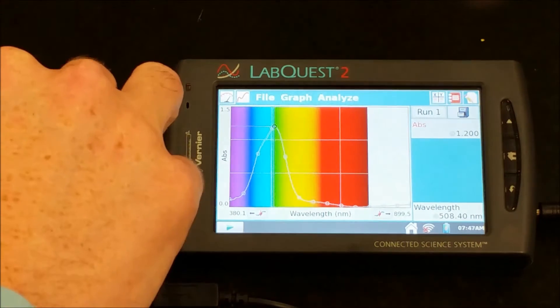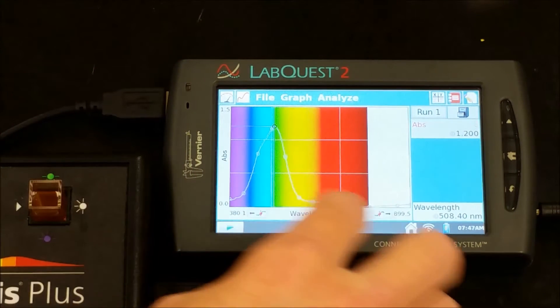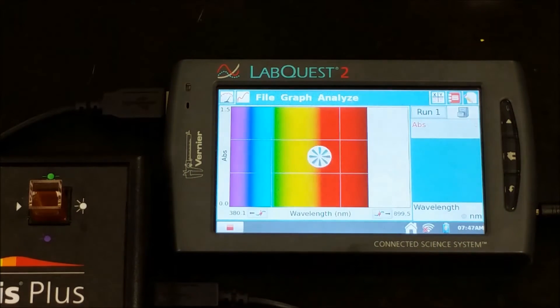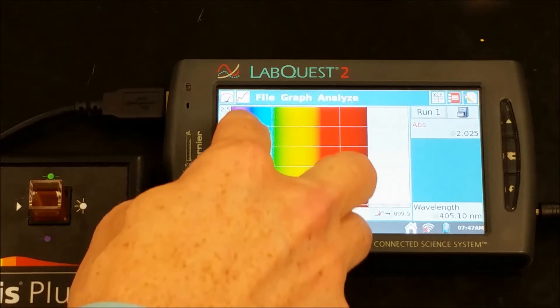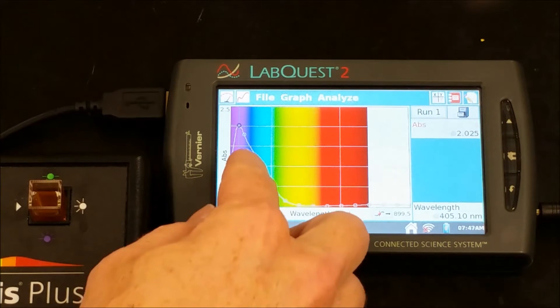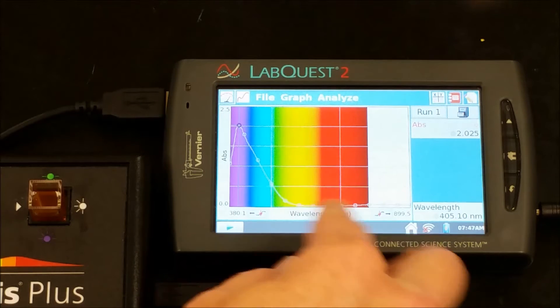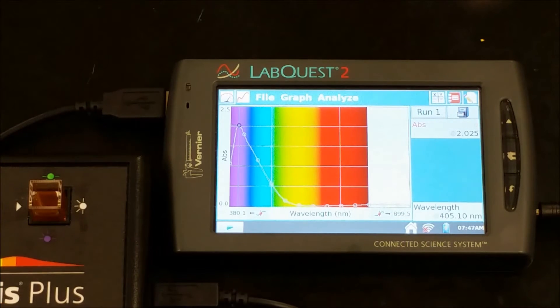Now we're going to take that out and put in the orange solution. We'll hit play again. Now we see that purple is the biggest absorption, some blue is being absorbed, and we're seeing a lot of red, orange, and yellow being transmitted through the solution.